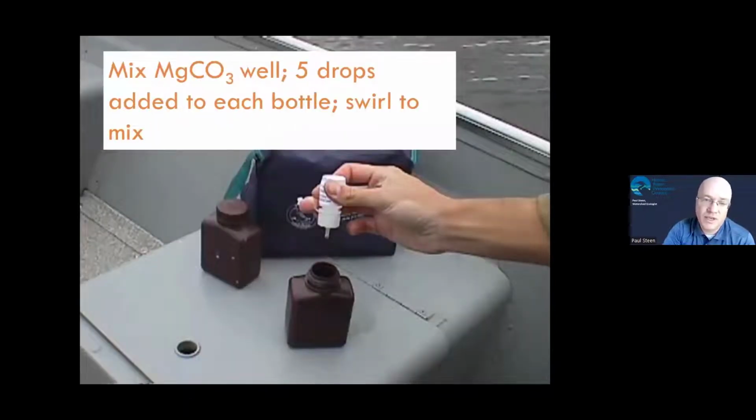Oh, sorry, you don't cap them yet, because before you do that, you also have magnesium carbonate, and it comes in a little dropper bottle. You can shake that vigorously. Really mix that up good, because the precipitate settles out on the bottom. So you want a nice mix there.